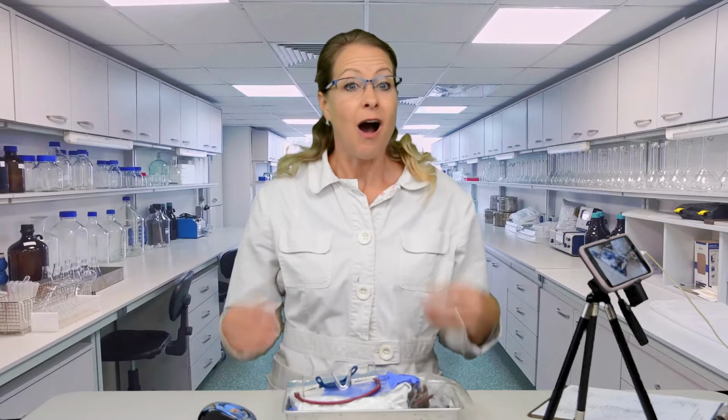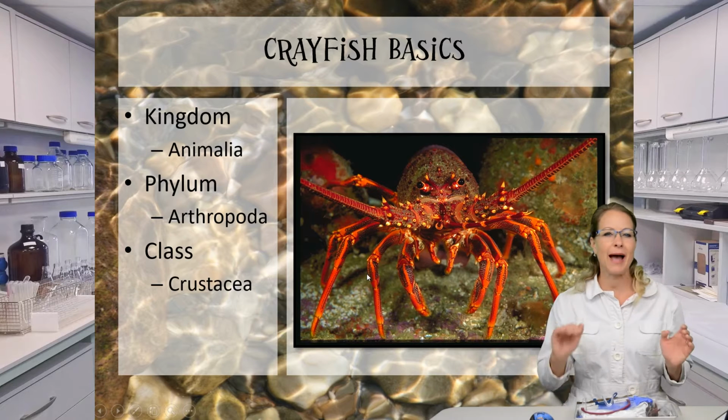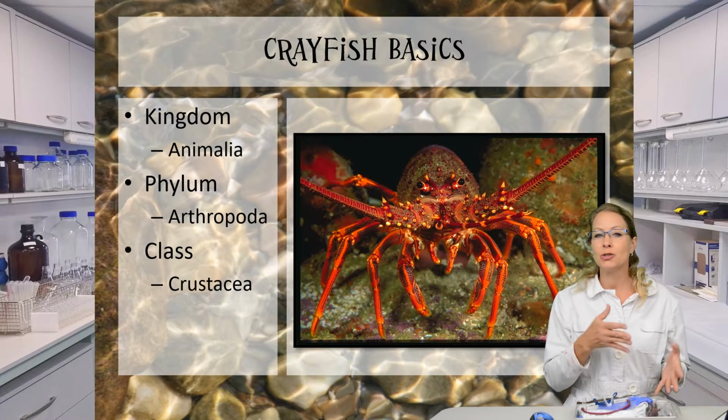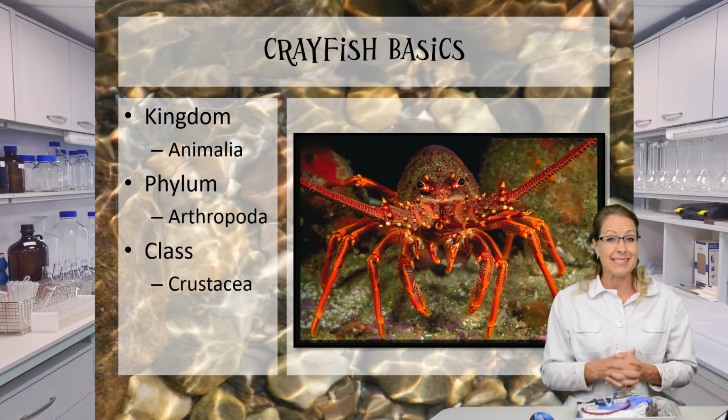Today is going to be an amazing day because we are going to be doing the basic anatomy lab on the crayfish. That's right, I said the crayfish. You may not have seen one in person before, but we get to see one up close and personal today. So let's take a look at our lesson plan. We're going to learn a little bit about the background before we get into starting to identify some of the structures outside and inside our crayfish.